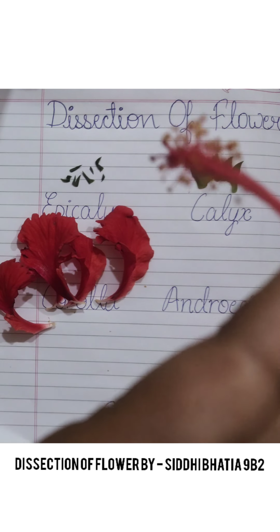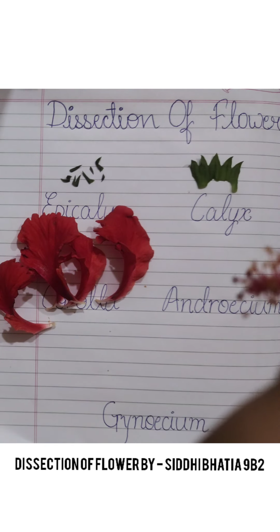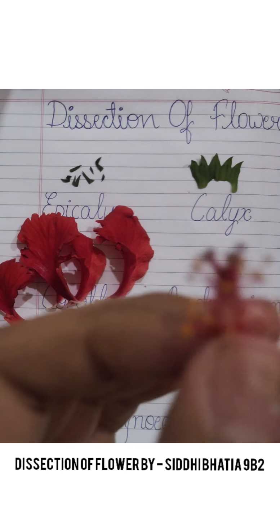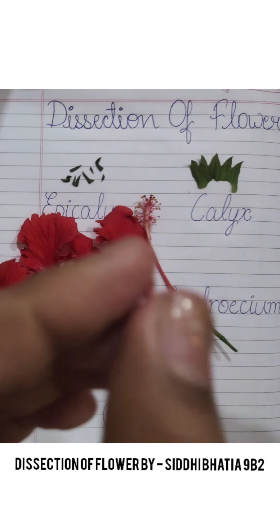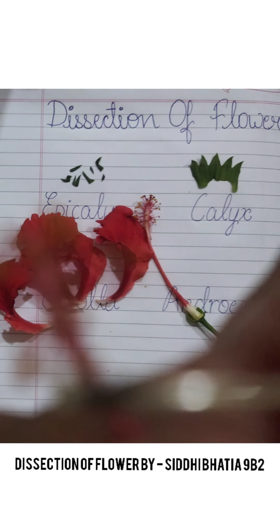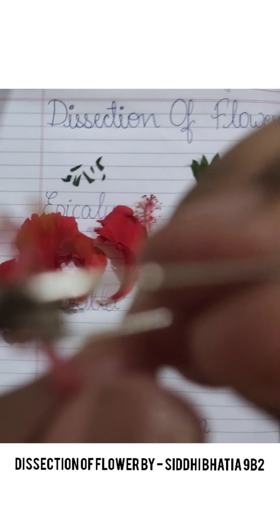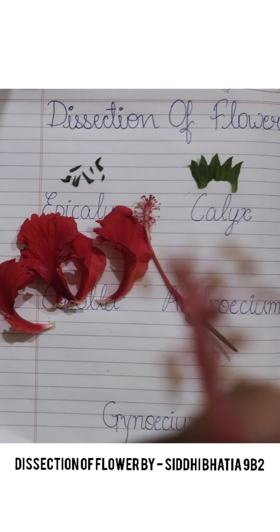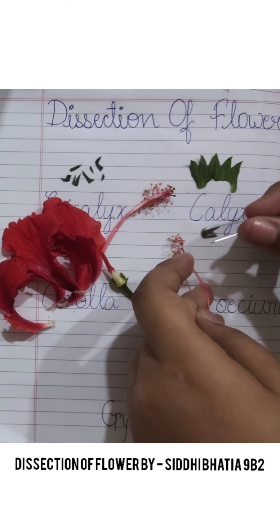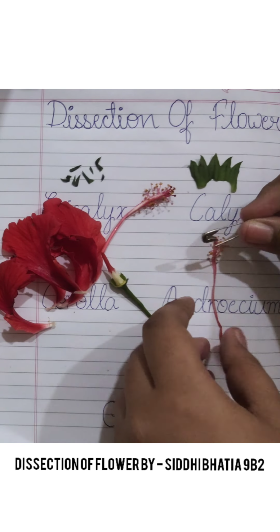This tube-like structure is known as staminal tube. This is filament, and at the tip of the filament there is anther. So it is a part of androecium. You can see it clearly, it is visible.